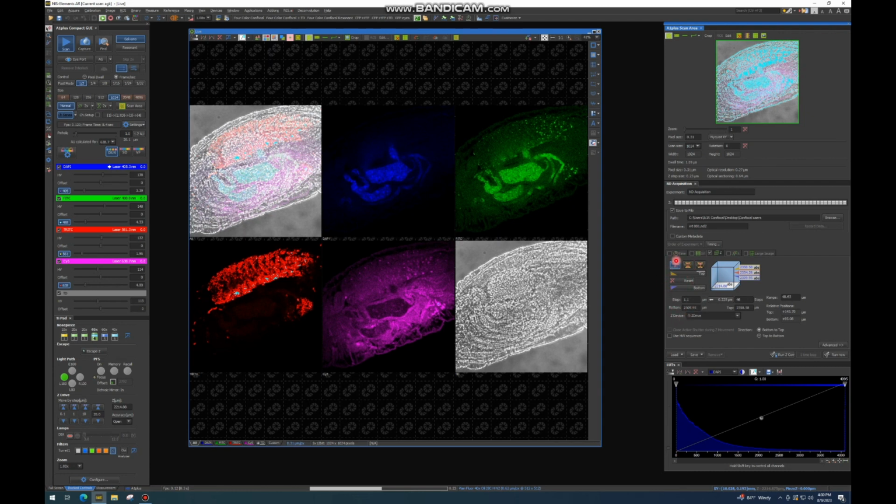If you choose to use the top and bottom define, just make sure when you're going between samples, you click Reset to clear the old Z positions. With this, you can also define the step size. The smaller the step, the more images you'll have in a small area. The larger the Z steps, the more distance there will be between each.